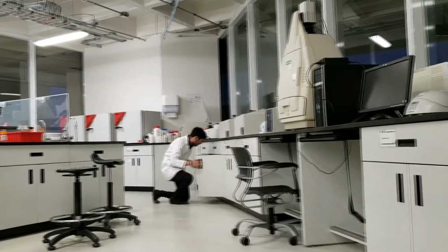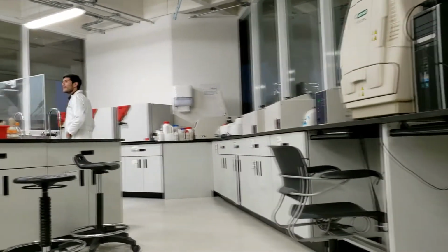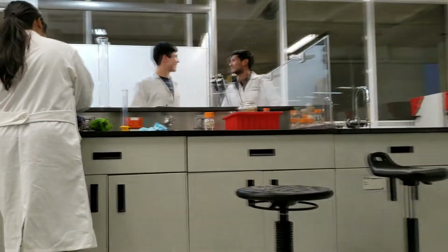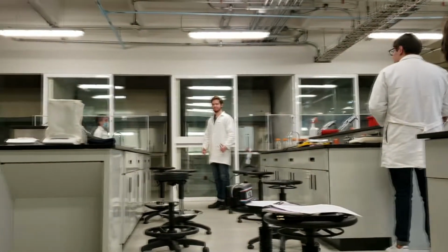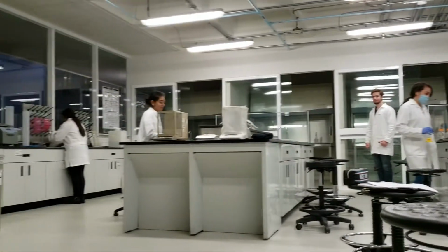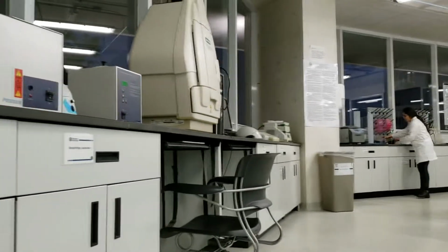This practice consisted of three activities. The first activity aimed at acquiring knowledge of the materials and equipment that form part of the genetic engineering laboratory, where they are located, and their respective functions. The second and third activities aimed to analyze the accuracy and precision of the micropipette.